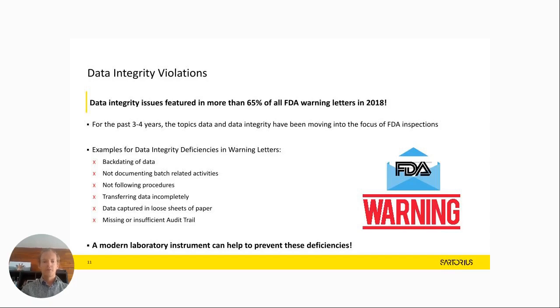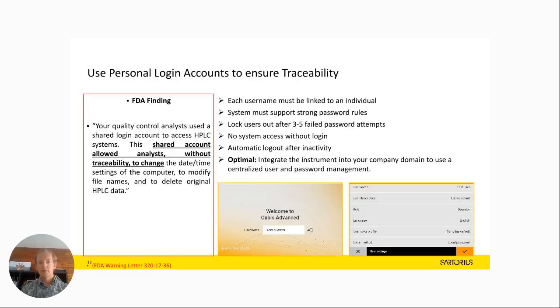So I've brought a few examples from the FDA, so we can take a look at exactly what they mean. So we found from the FDA that they complained about, or they said they had a finding, that shared accounts allowed analysts without traceability to change date and time settings and modify data. Shared accounts, is there the issue?